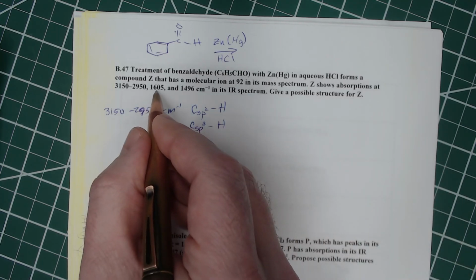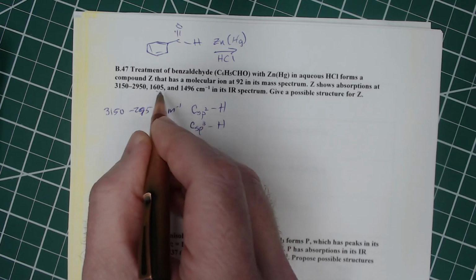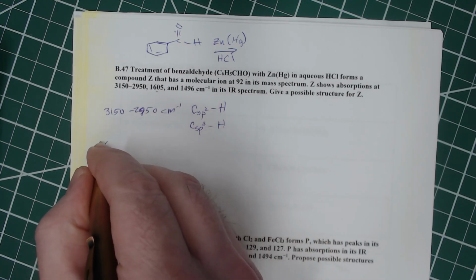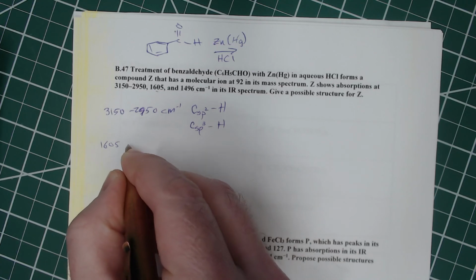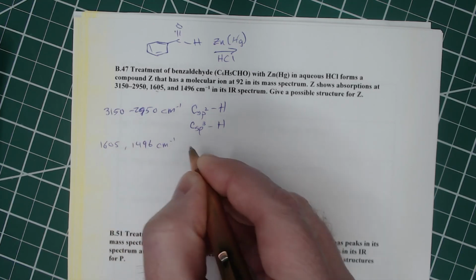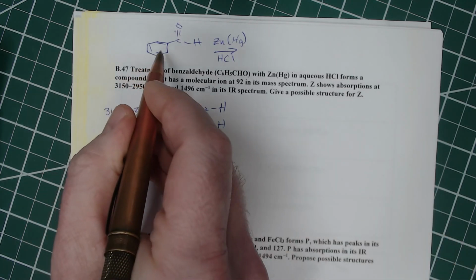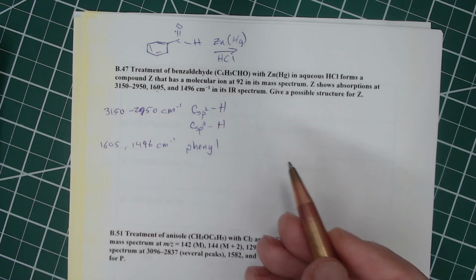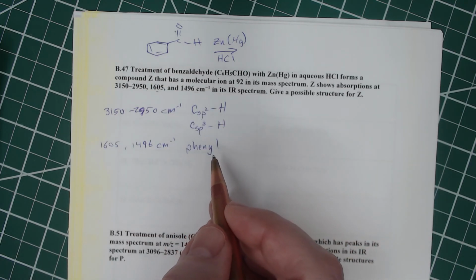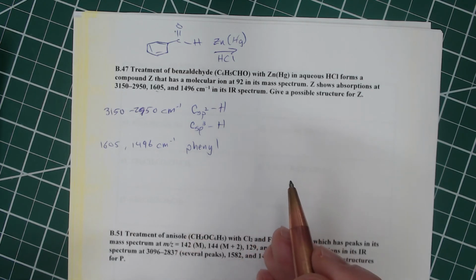All right, 1605 and 1496. Those two peaks tell us that our phenyl group is still there. Not surprising. We started with a benzene ring, we're going to end up with a benzene ring. You'll notice what's not here is a carbonyl.